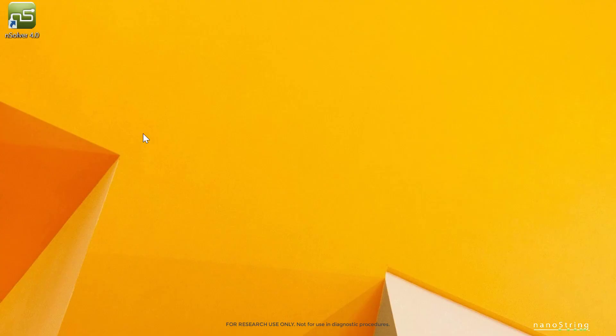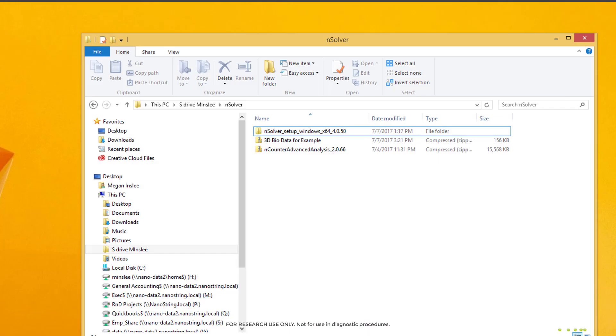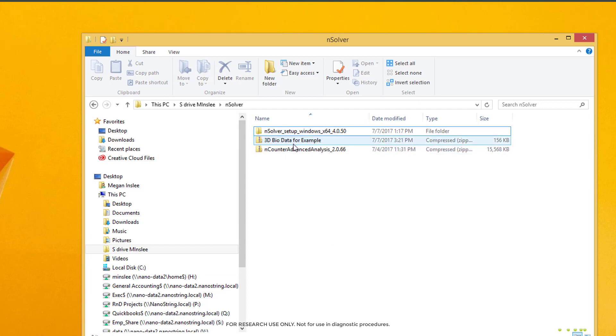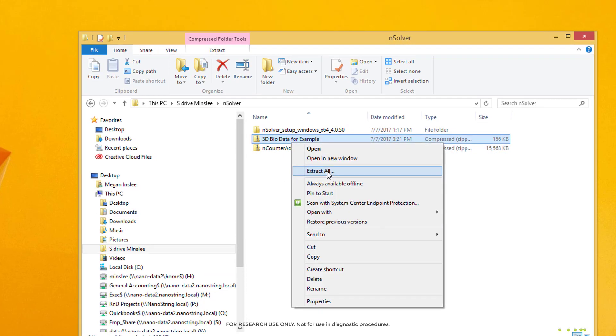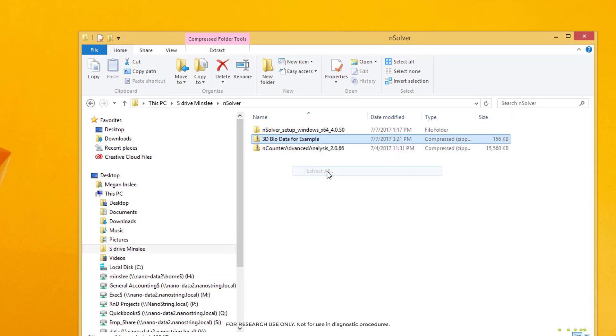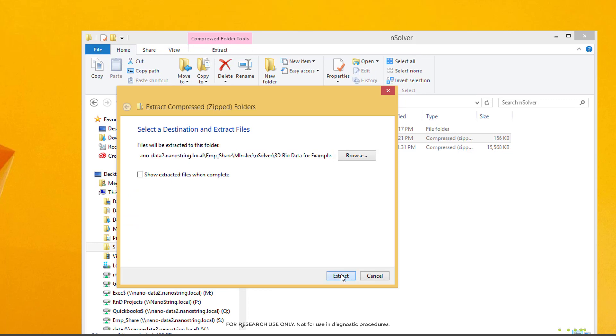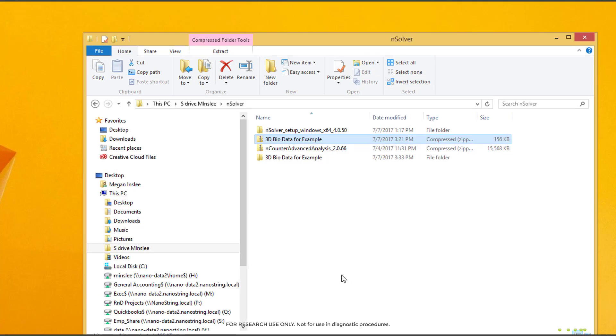First, we'll import our data. Before we open NSOLVER, we'll navigate to where our data is saved in its zipped folder. We'll extract it by right-clicking on the file and then selecting Extract All. If that option is not available, you may need to seek out an alternative software extraction tool.